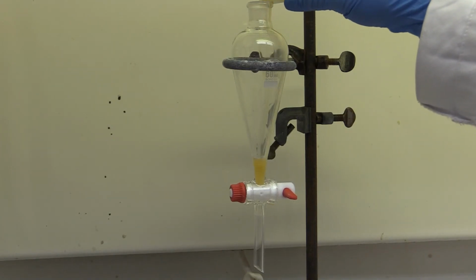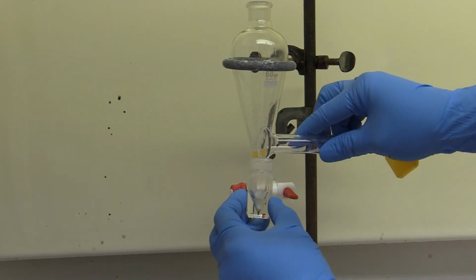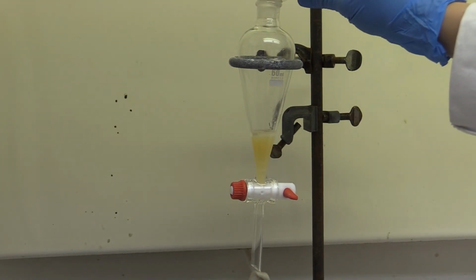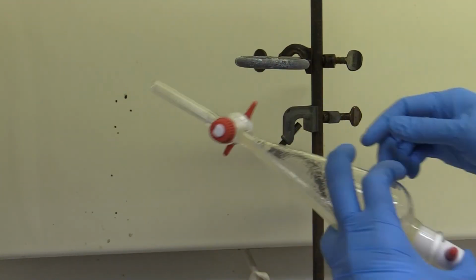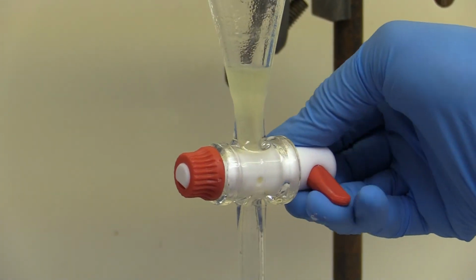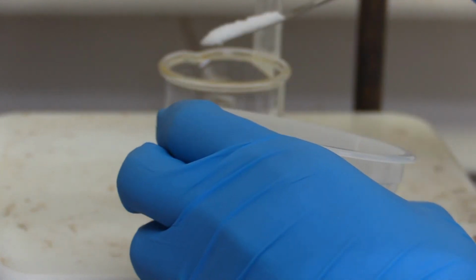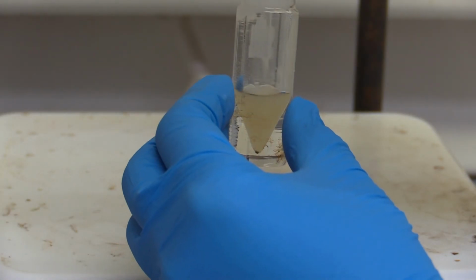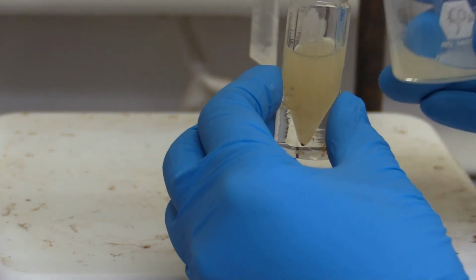Transfer the mixture to a separatory funnel using dichloromethane followed by water to transfer. Shake the separatory funnel gently but thoroughly for extraction. Collect the dichloromethane layer and dry it with sodium sulfate. Collect it in a clean, dry 5 ml conical vial.